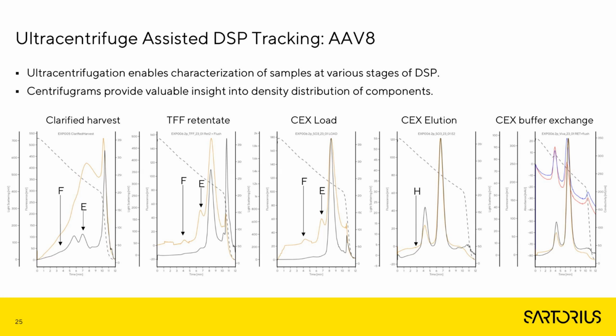So the monitoring of the AAV purification was nicely implemented with this approach, and we were able to see certain components or certain impurities that are not able to be distinguished with traditional chromatography methods or other analytical methods that are used for this type of sample characterization. So we were very happy with the results of this profiling, and the method turned out to be quite interesting for further characterization of AAV samples.